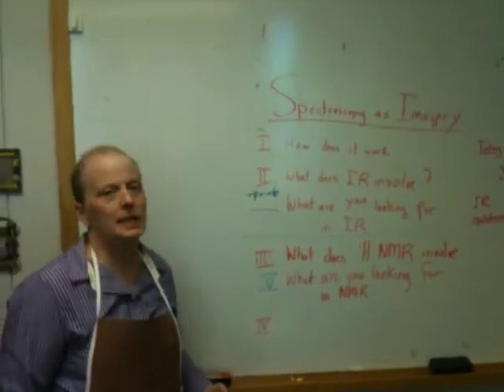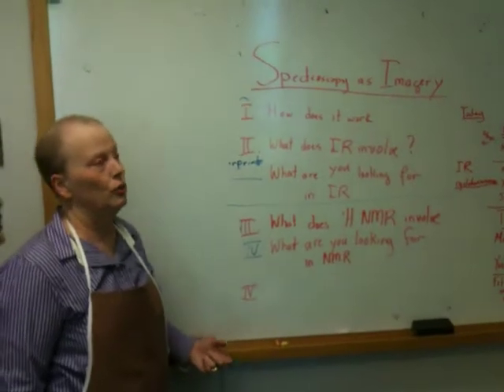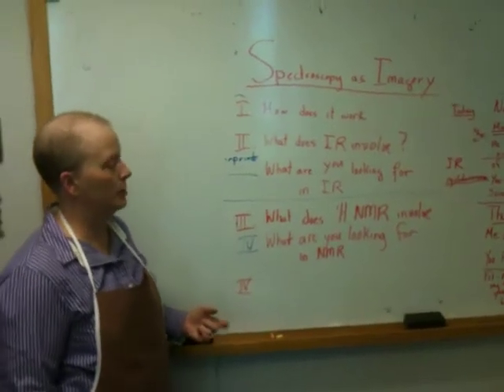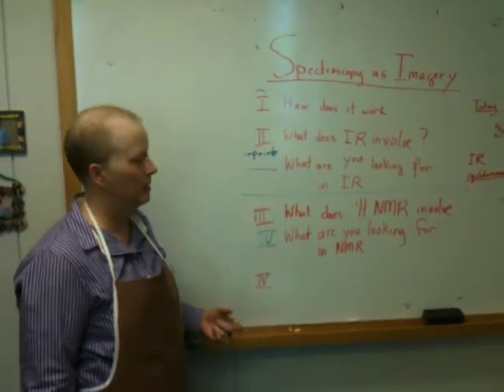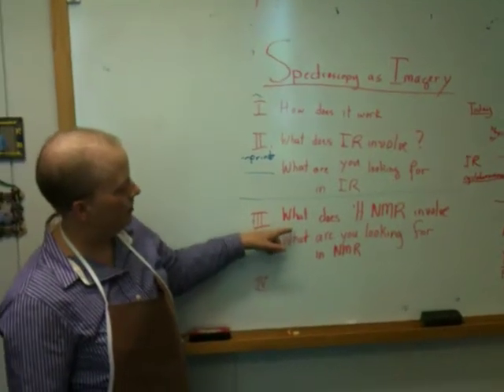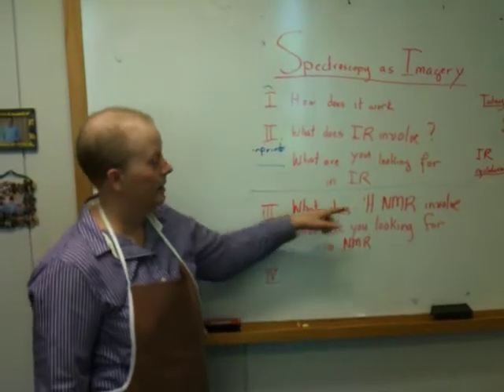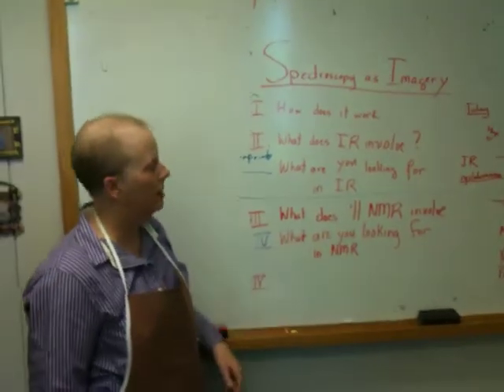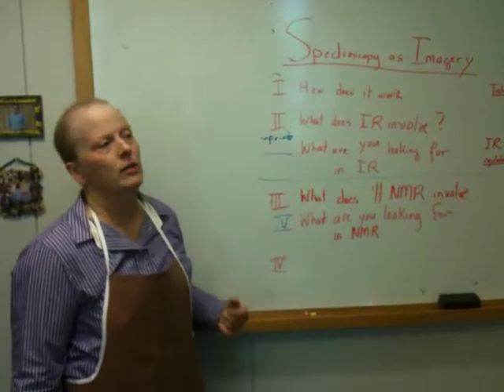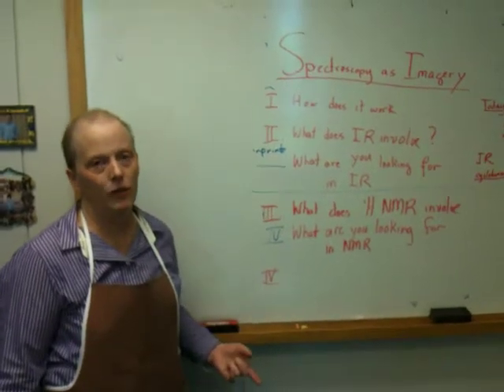The idea behind this, again, is to always be looking at the link to the spectral database that we're linked into. It's called the Integrated Spectral Database. It comes out of Japan, and it's an absolutely outstanding database. What you want to do is look at lots of proton spectra, not carbon-13, but proton spectra, so that you start to understand the topography and the landscape of different functional groups or compounds that possess different functional groups.